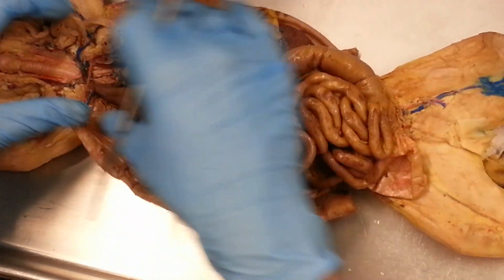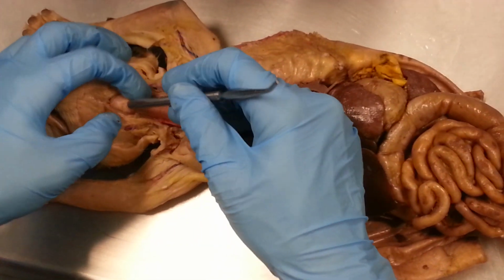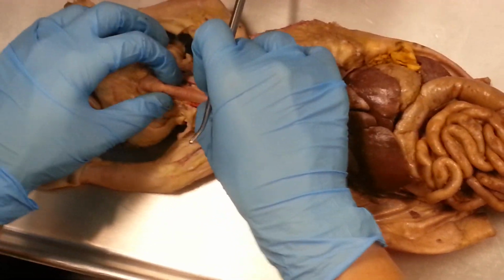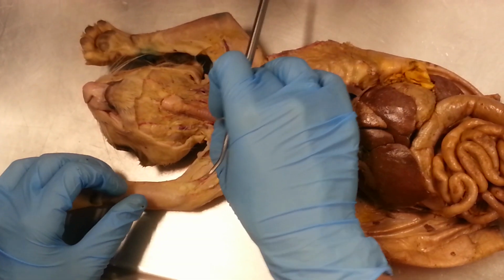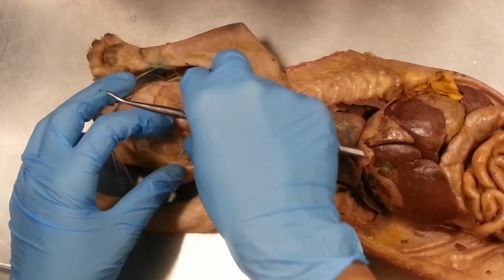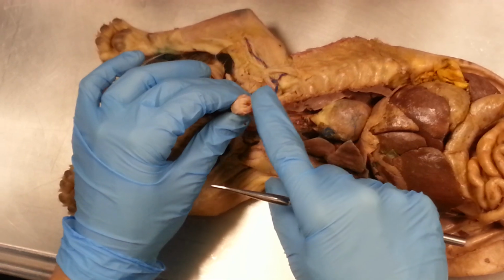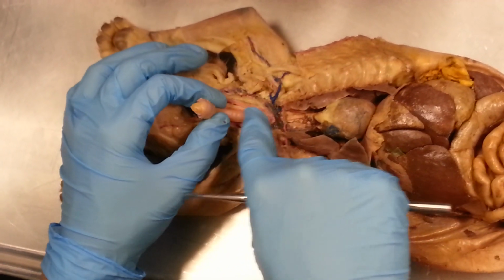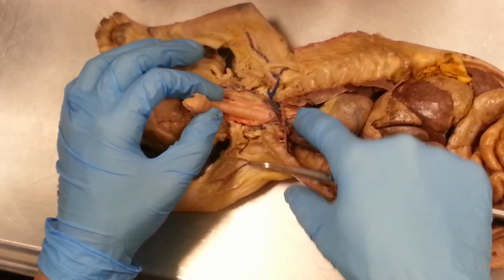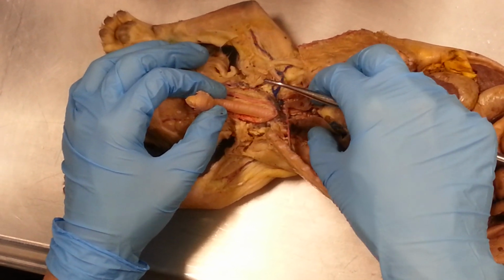The only thing that we need to go over now, respiratory system. This is my trachea, this whole tube. Within the trachea, I've got my voice box, that's my larynx. At the top of that, I've got a flap of connective tissue that's going to cover up my trachea so that I don't get food or spit or drink or anything into my lungs.